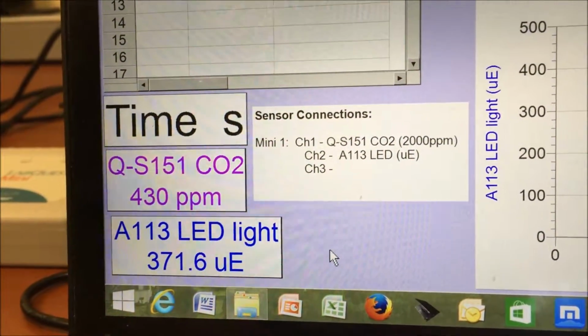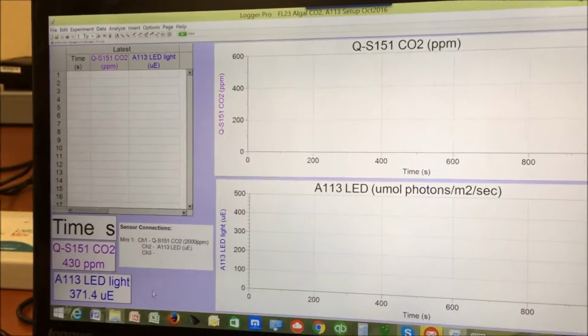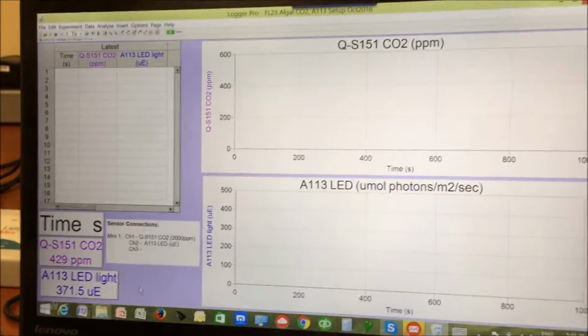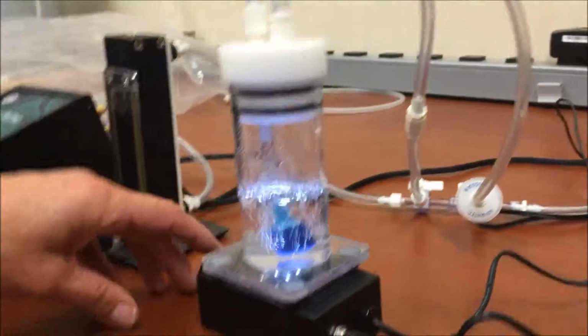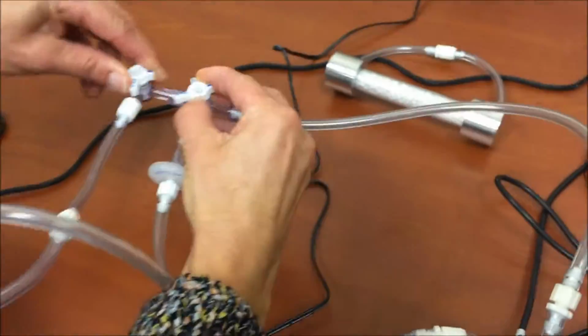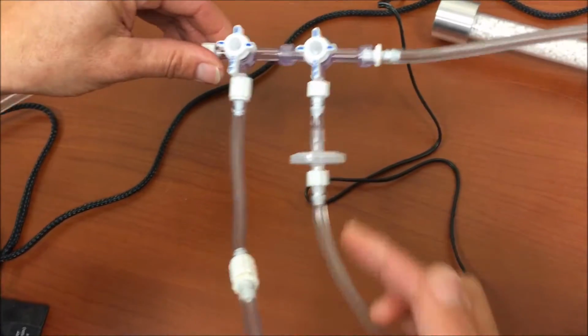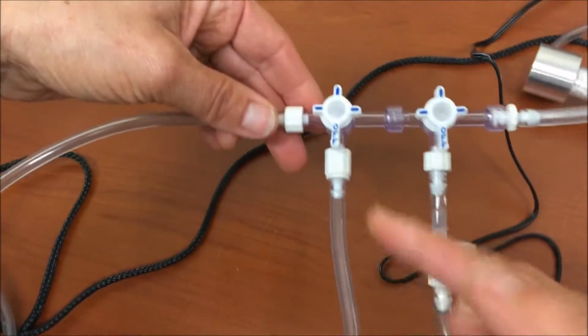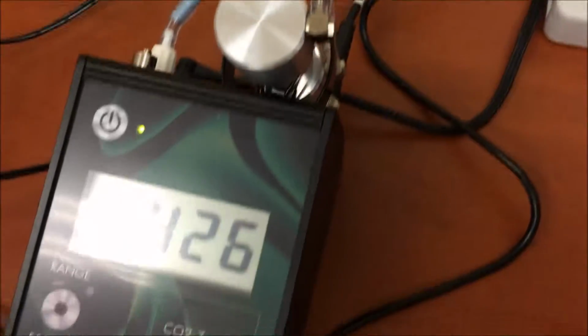To start an experiment, you would first observe the reference levels of CO2, and you do that by bypassing this cuvette with these two valves. Put them in the off position towards the chamber. Now all the gas, the reference gas, is going into your CO2 analyzer. You can see it stopped bubbling, so it bypasses the cuvette.